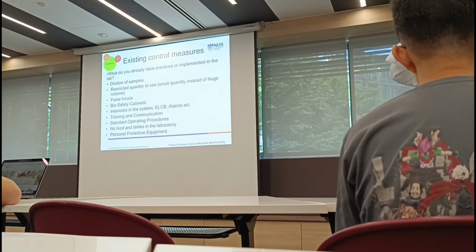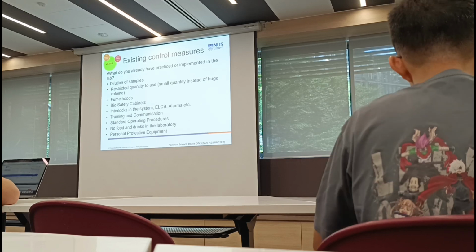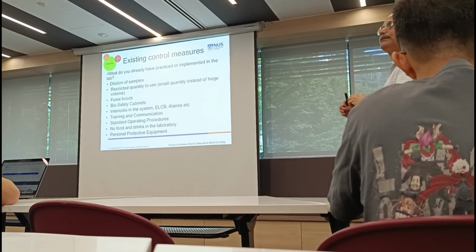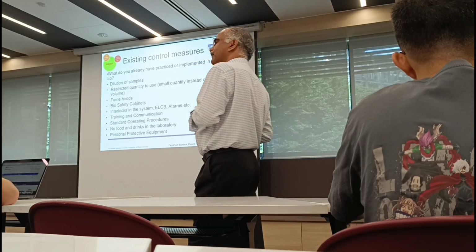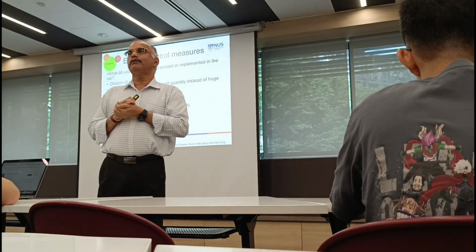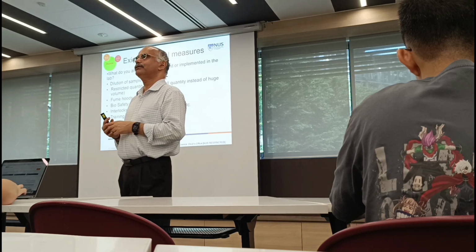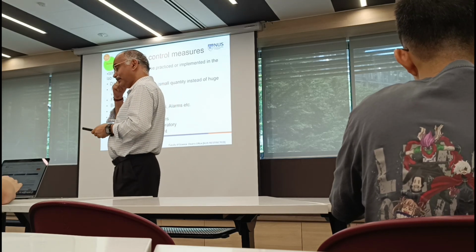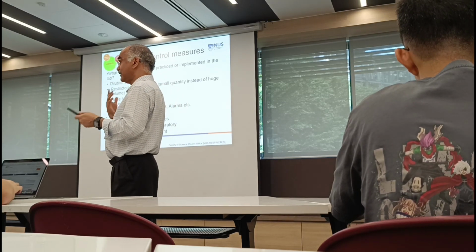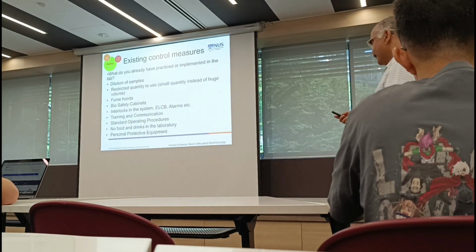As I said earlier, never do the large scale reaction the first time. You always do it on a small scale first and then scale it up. The first time, when you do small scale, all the hazards are minimized. Yeah? Because if something goes wrong, if there is a fire, then you have a very small fire as compared to a large scale fire, right? So you can handle those things. And you will learn a lot by doing the small scale reactions. You get experience with how to handle those things.